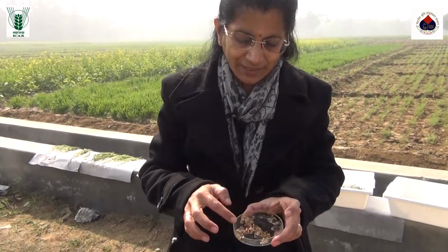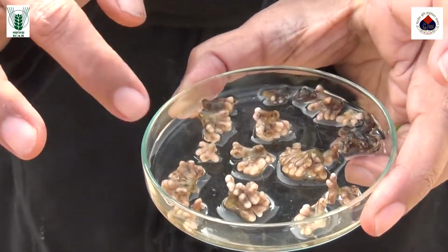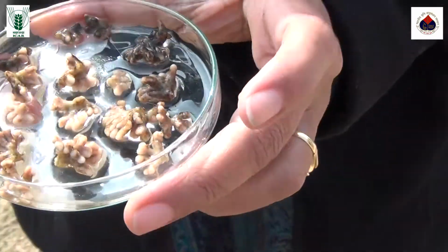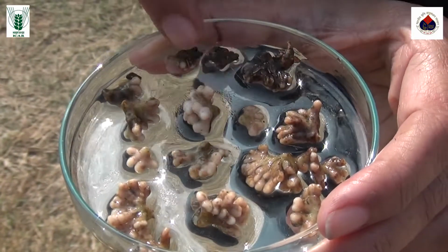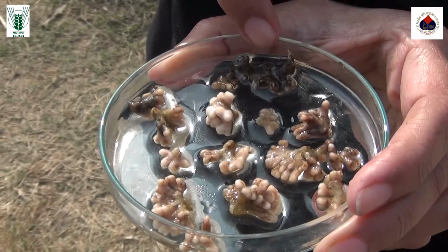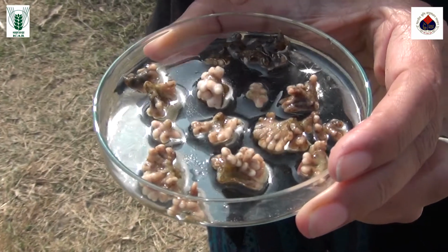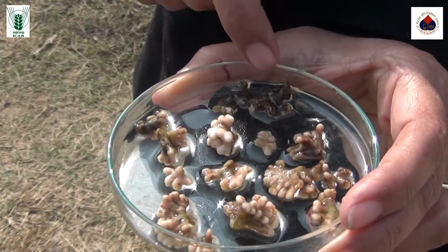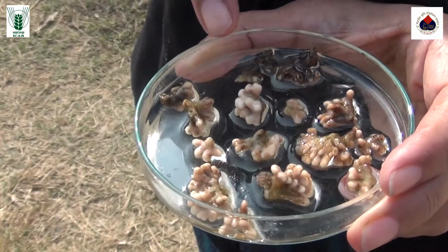So here you can very clearly see these are the lobed nodules of chickpea. These are the good ones, the ones which are showing pinkish color, you can very clearly see that. See this, and this brownish one is a senesced nodule, which is already old. If you squeeze it, you will not find the leghemoglobin here. Some brown fluid will ooze out. So this is a senesced nodule, and this will no more be an effective conversion of nitrogen to ammonia. But in all these other nodules, you will find the nitrogen to ammonia conversion taking place.